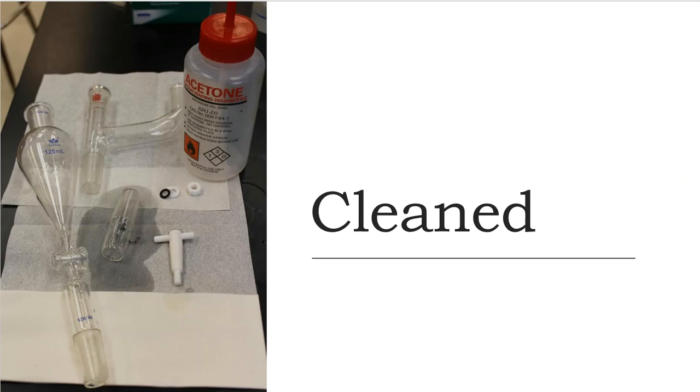All right, so in this next picture, I did my job like a good little lab boy. I think my lab mama will be very proud here. And if I look at the glassware, I see that the glassware has been completely cleaned with acetone. And folks, this wasn't very hard to do. I just squirted acetone on the inside. It took away the iodine. It took away the color. It makes a great solvent for iodine. I also took the stopcock out of the separatory funnel because this also has iodine on it as well.